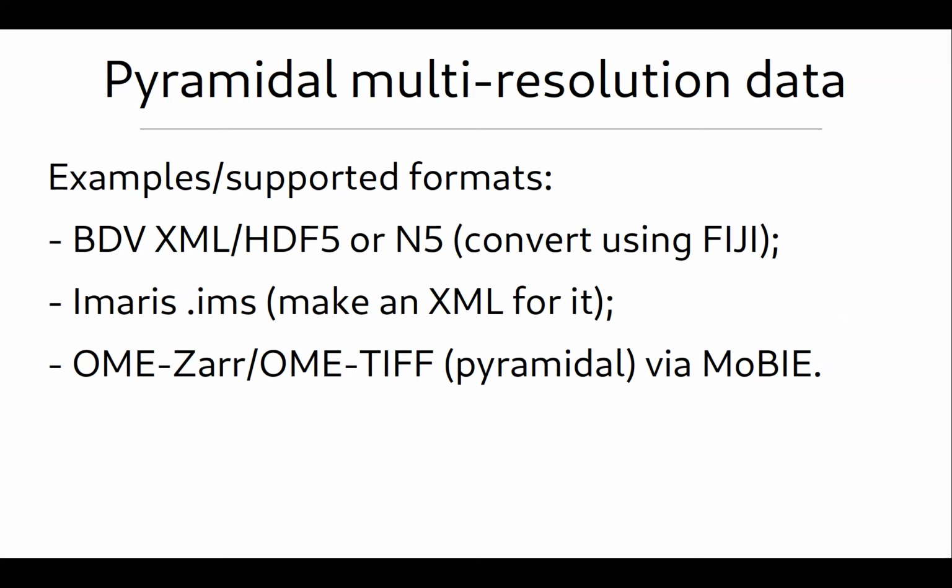They basically start to build this resolution pyramid, right? Imaris, Arivis, all these guys work in the same way. Alternatively, there is now a rise of OME-Zarr formats, which are also pyramidal, and also store things like that. In principle, BigVolumeViewer works with them using the MoBIE plugin from Christian. We will talk about it a little bit later.